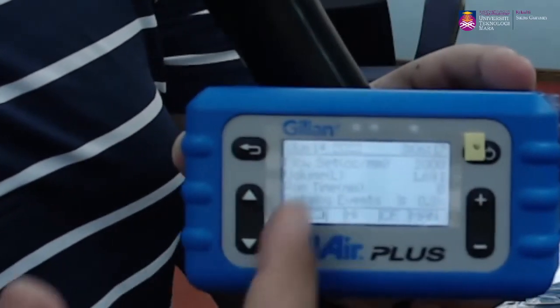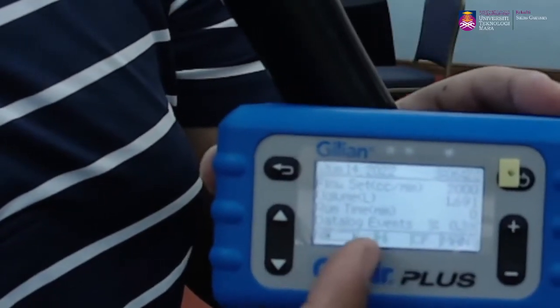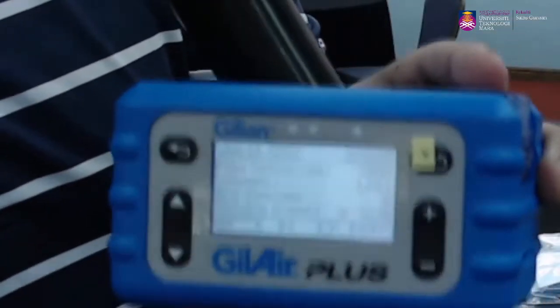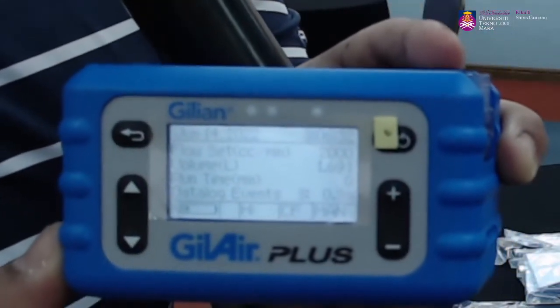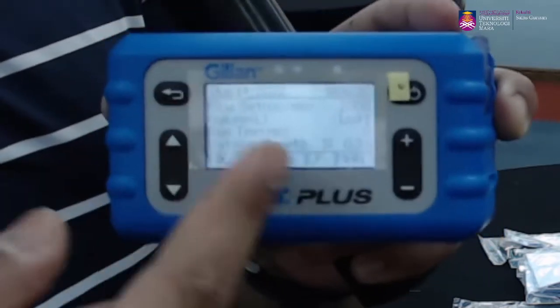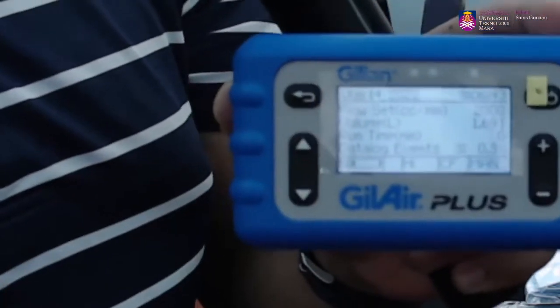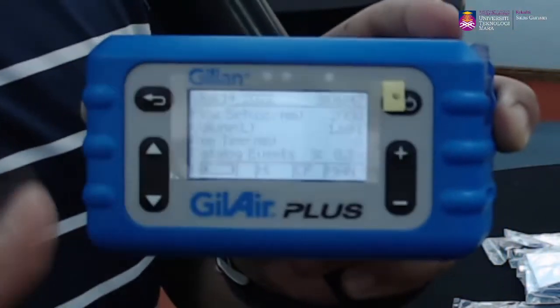Okay, so dia akan bagi kita in terms of summary yang kita dah last kita buat berapa, runtime kita berapa, and then data logging events yang kita dah accumulate berapa. Contohnya macam tadi yang saya dah tunjukkan in terms of apps tu, dia akan bagi tahu kita in terms of further apa yang kita dah go through tadi. So, yes, selama kita collect ni yang 2000 cc per minute ni constant ataupun tak, ada fluctuation ataupun tak. So daripada situ kita boleh analyse further, tengok in terms of kita punya sampling setakat ni, okay ke tak flow rate dia, maintain ataupun tak.